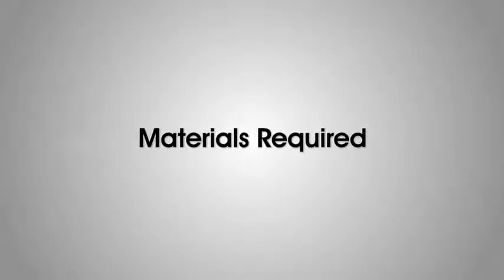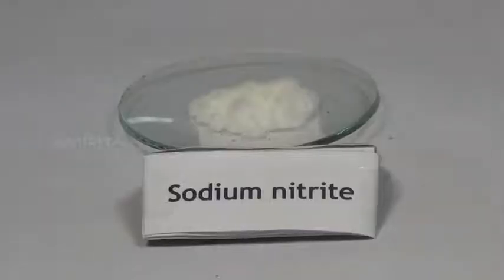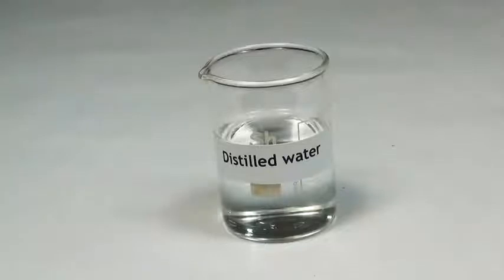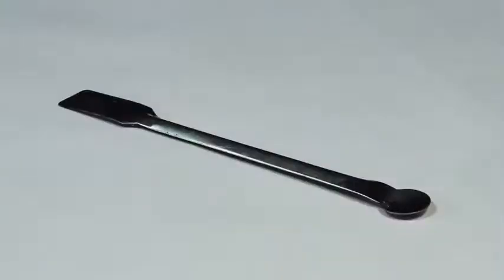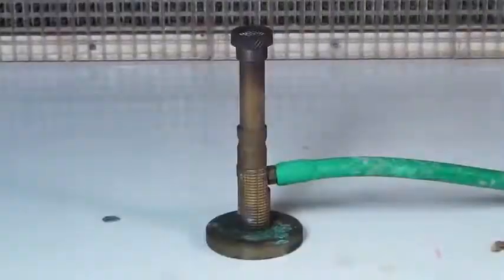Lieberman's test. Materials required: organic compound, sodium nitrite, concentrated sulfuric acid, distilled water, sodium hydroxide solution, test tube, spatula, droppers, water bath and Bunsen burner.